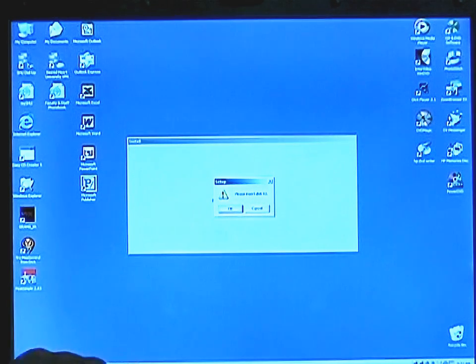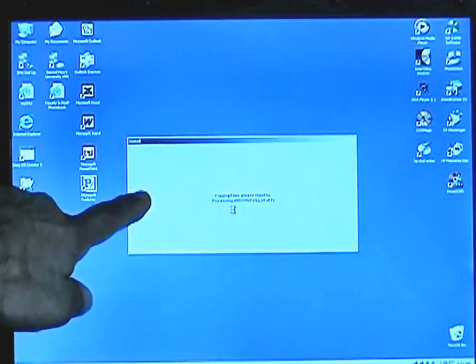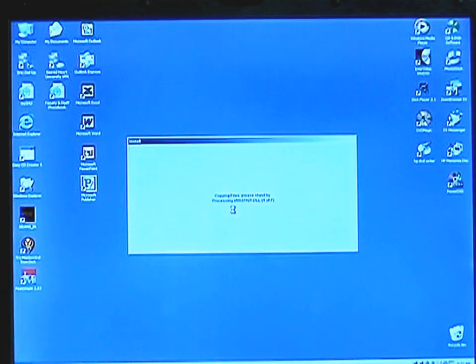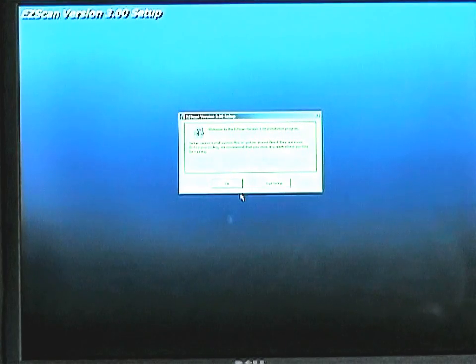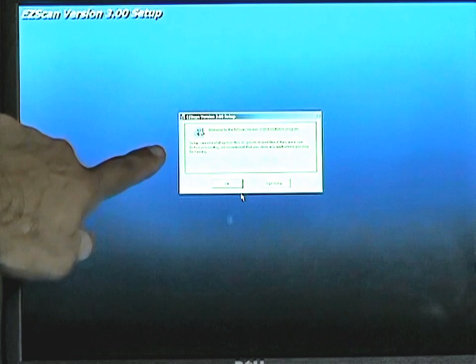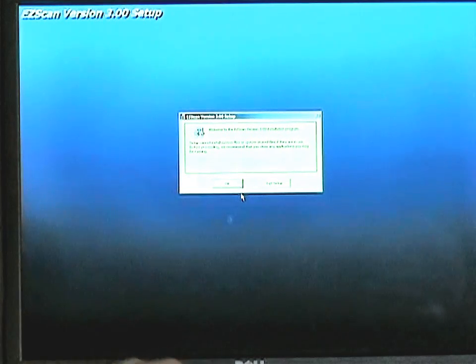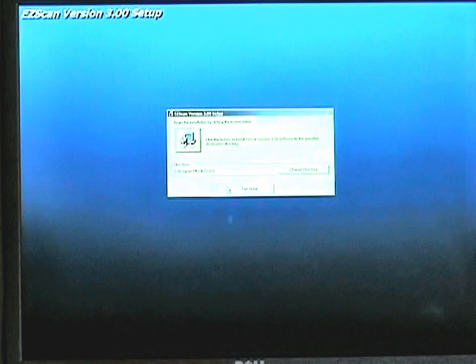When prompted, remove disk 1, insert disk 2, and follow the procedures on the screen. After both disks have loaded the setup files, you will come to the installation screen. Make sure no other programs are running in the background and click OK.